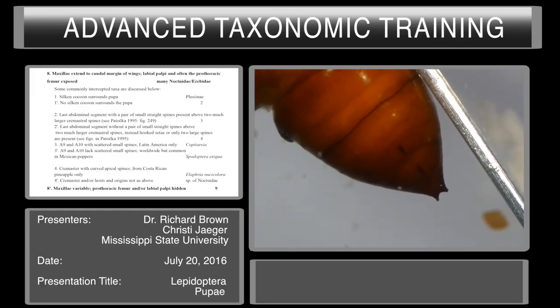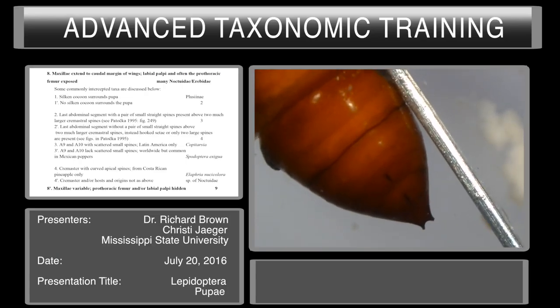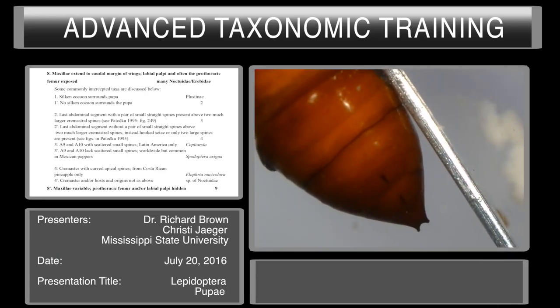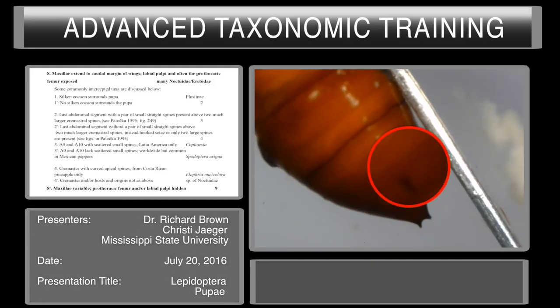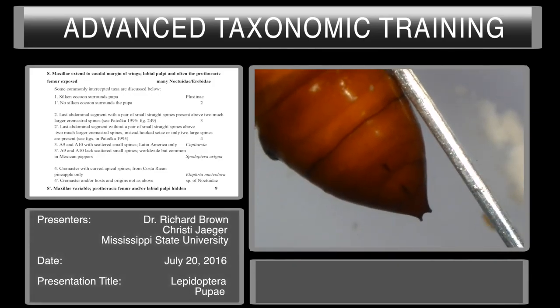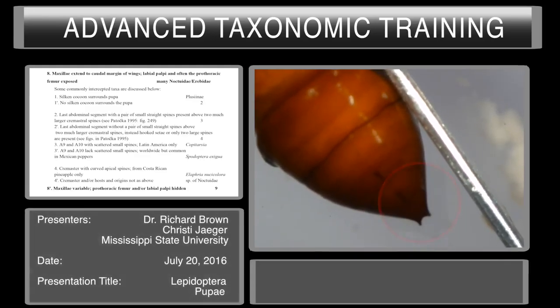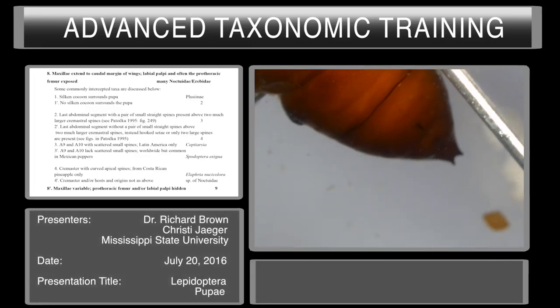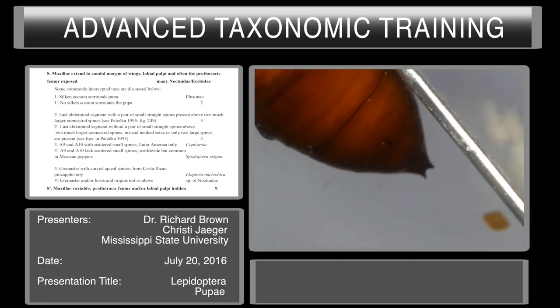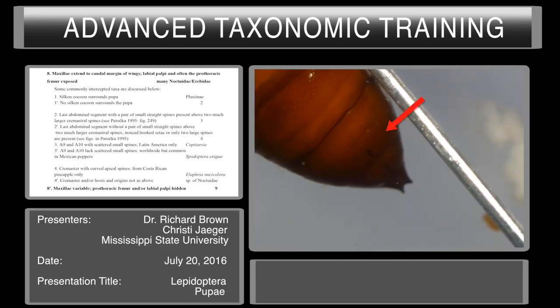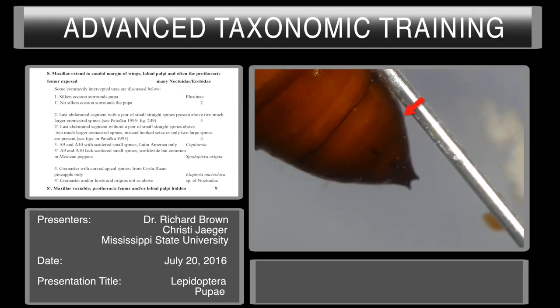For this demonstration we will be showing you how to sex pupae. Here we have a male pupae. We know this because we can see the gonopore, which is anterior to the anal slit. The gonopore is on the ninth segment, and we can see the intersegmental region between the ninth and the eighth, right above it, is a straight line.